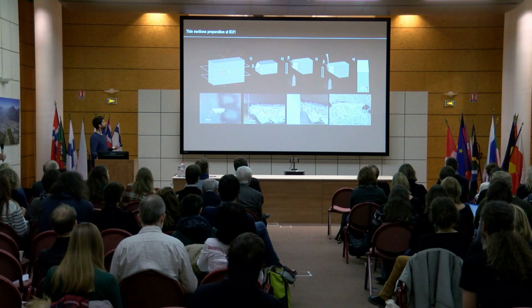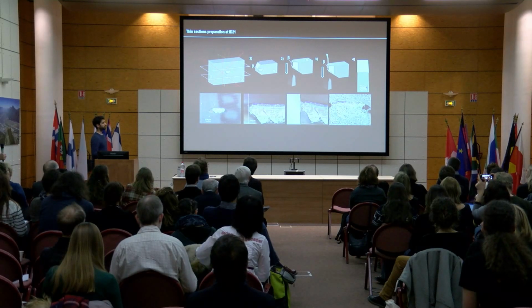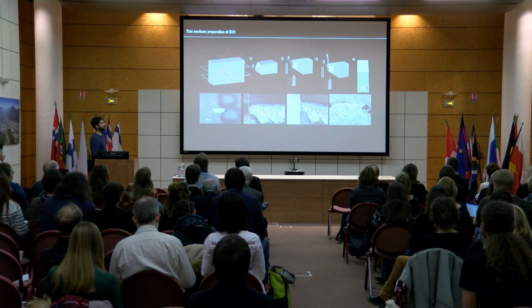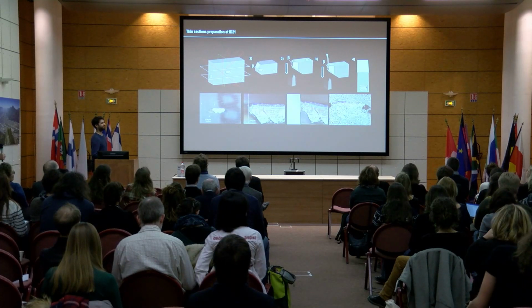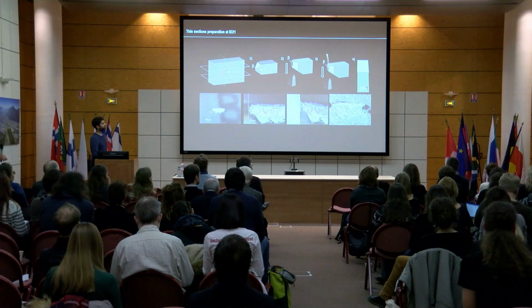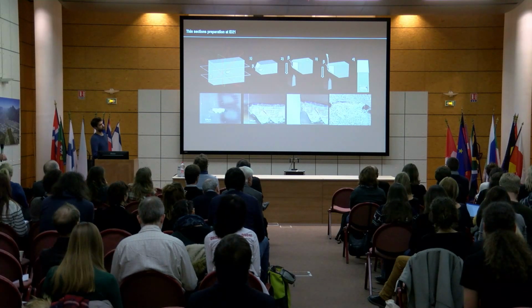So the cross sections that you see on the left were from a database collection of samples, and we wanted to extract thin sections from this. And instead of cutting parallel to the surface of the sample, what you see here is that we decided to cut perpendicular to one side of the section. So even if you have samples which have been taken decades ago, embedded decades ago, and you consider that thin sections may be better than cross sections, it is something we can do a posteriori, just to explain it.